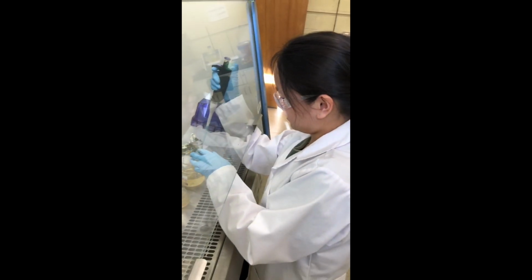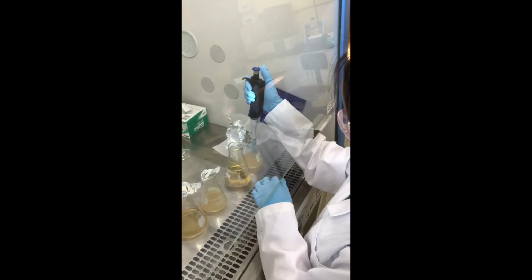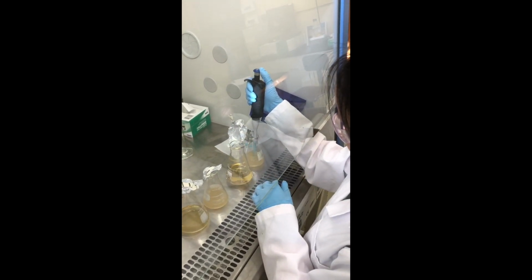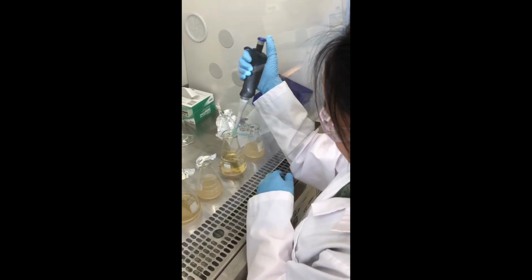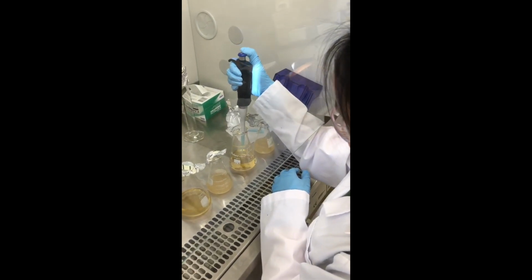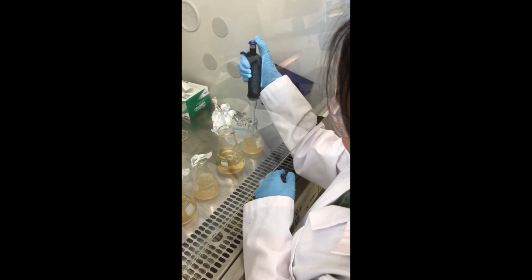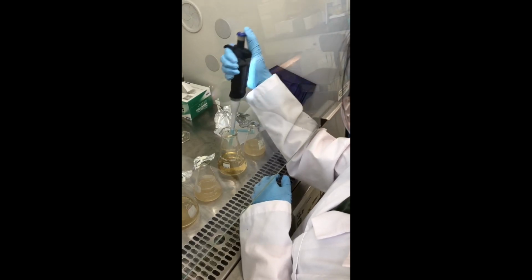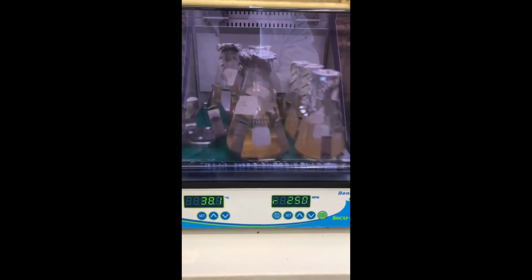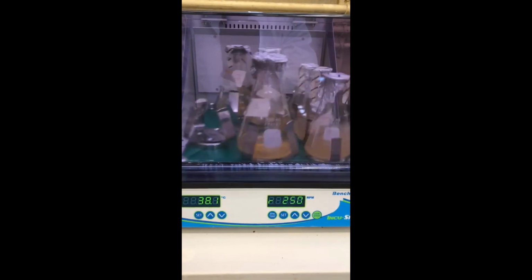Before beginning the benchtop shaker, fill each 250 milliliter flask with 100 milliliters of fresh media and pipette 2.5 milliliters of the inoculated bacteria into them. Immediately extract 1 milliliter from each flask using a micropipette. Place it into a clean cuvette and measure the absorbance at 600 nanometers. Set the benchtop shaker to the desired mixing speed and place the flask inside to begin cell growth.